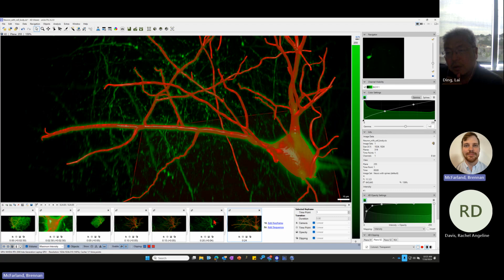So if you wanted to zoom in. One more time? I just wonder in what circumstances we want to do it like this. It's just personal preference.